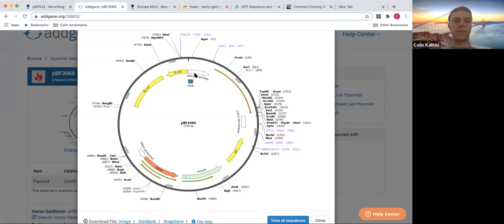And that's important, right? Because let's say we want our bread to be the greenest bread you've ever seen in your world. You're gonna need a lot of plasmids for that. You want it to replicate a bunch. Let's say we want to do a lot of experiments with it. You want more plasmids. Another thing that's important is make sure your origin sites are unique enough to be recognized.